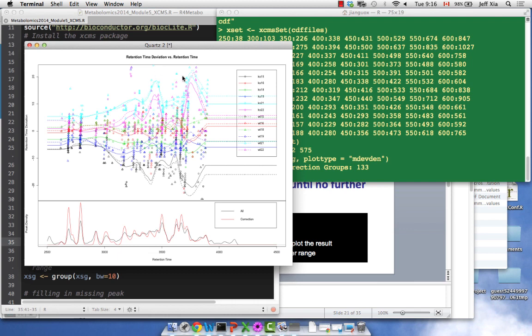So is this the adjusting? Yeah, this is for each spectra. It plots how much they've been adjusted based on their alignment, how much each is shifted. So they adjust more for samples you think are shifted too much, and for some samples, really not much adjustment. Some samples try to increase, some may try to decrease. The final goal is to make them consistent so we can compare them.